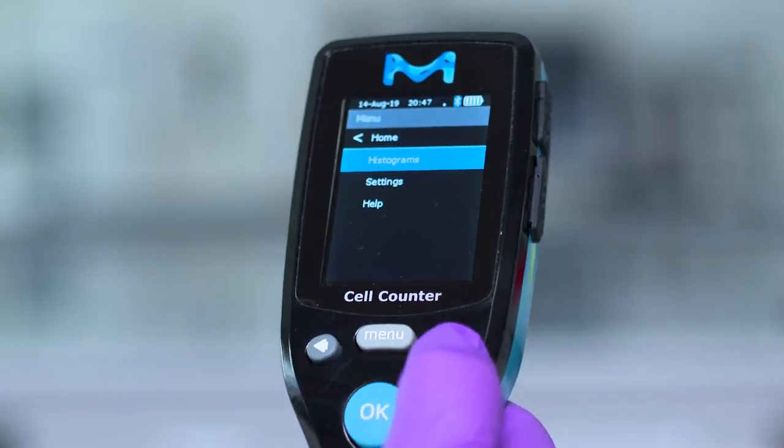The other way is to scroll to the desired histogram, select menu, histograms, and OK.